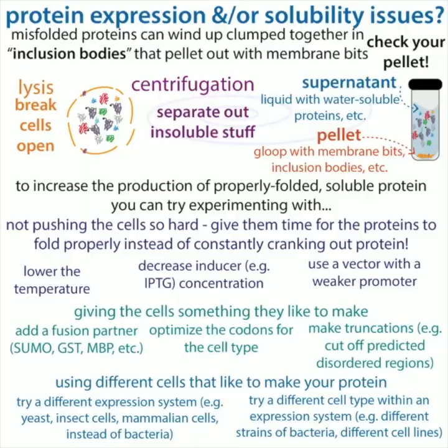And depending on what the problem is, there are different things that you can try to get the protein to express better. These involve things like changing the cells and changing the protein in simple ways. So let's take a look at how we can do this.